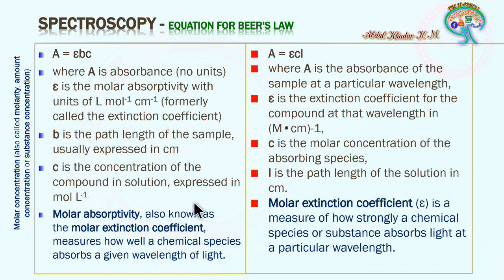So here the same molar extinction coefficient has been put as the molar absorptivity. So it measures how a chemical species absorbs a given wavelength of light. These are two different names given for the same explanation.